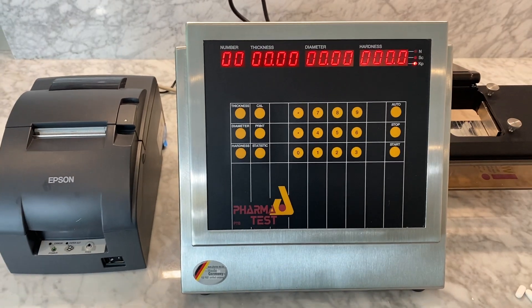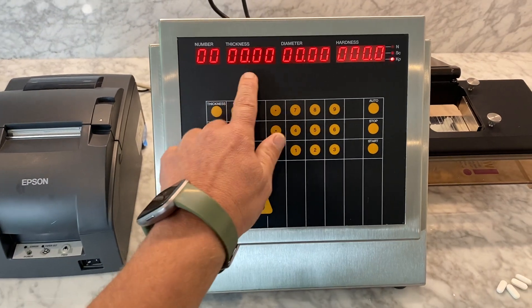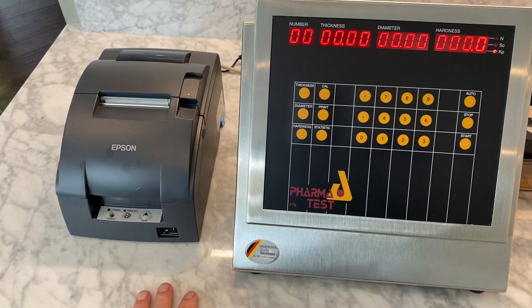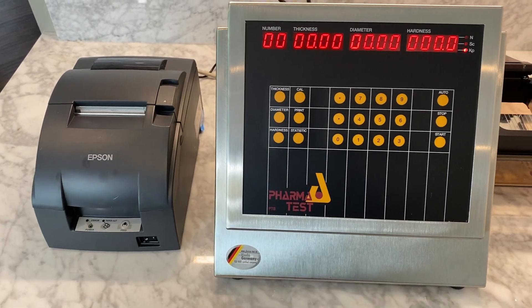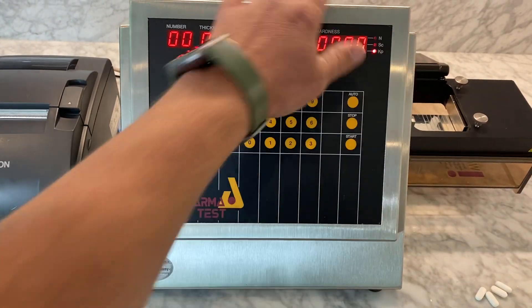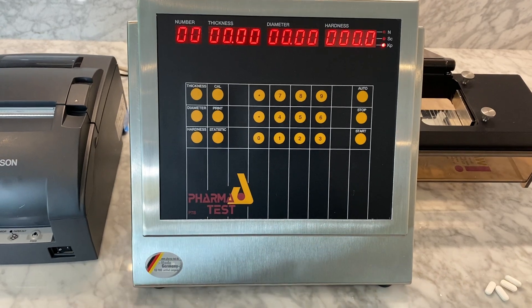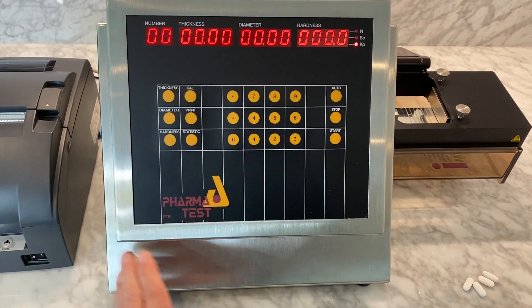This is the PharmaTest PTB 511 3-in-1 Tablet Thickness, Length, and Hardness Tester. Here we have an external Epson printer for printing out the results. The paper is non-thermal. You'll notice that the encasement of the unit is in stainless steel. It's dust-sealed to keep out dust in a dusty production environment, and you can also wipe it down with IPA.